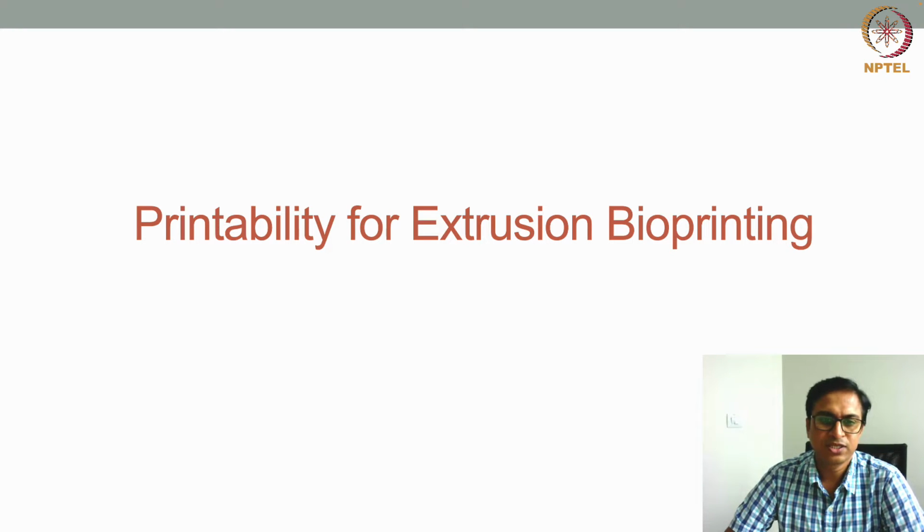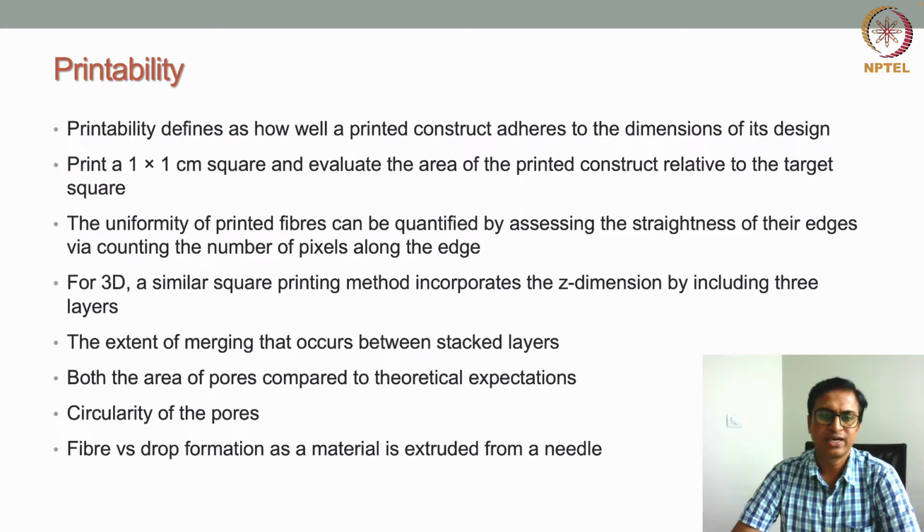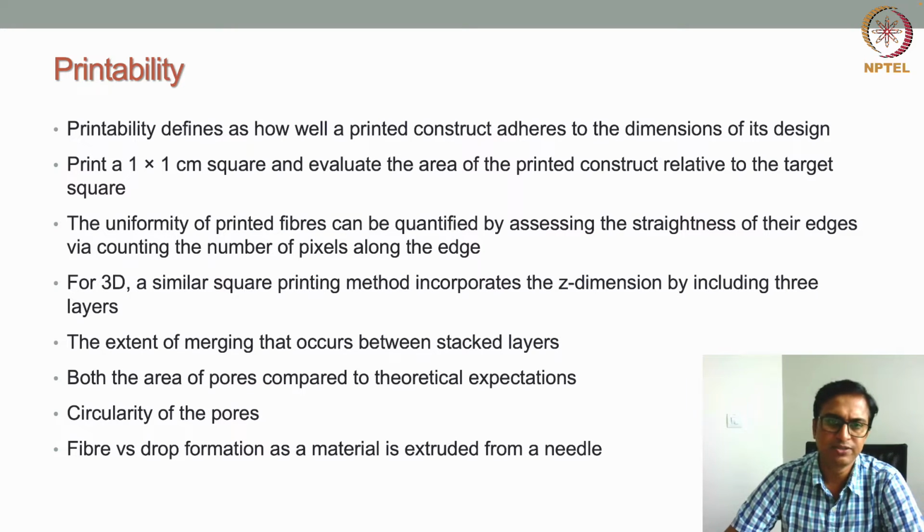In this lecture, we'll discuss printability. Basically, we'll define printability for extrusion-based bioprinting systems and what the different parameters are that dictate or decide the printability for an extrusion-based bioprinting setup. We'll discuss all these things here. Let us first start with understanding printability. What is printability?